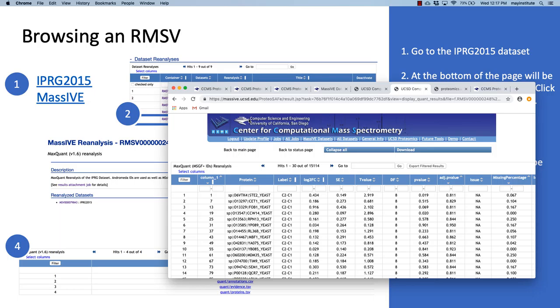Essentially, that first segment is separated from the rest by a space, and if it finds vertical bars, as in the UniProt format, it understands that that might be multiple things, that it's just different identifiers for the same thing. But other than that, it just takes the text as is. So there's no particular rule for what the headers need to look like.